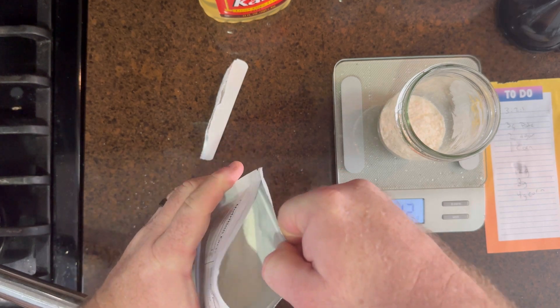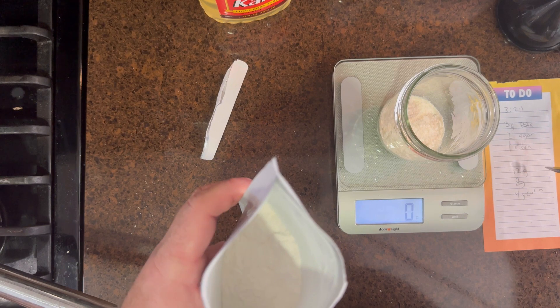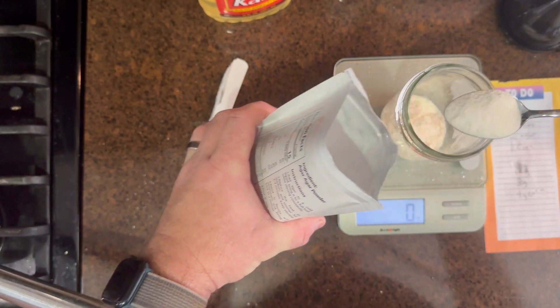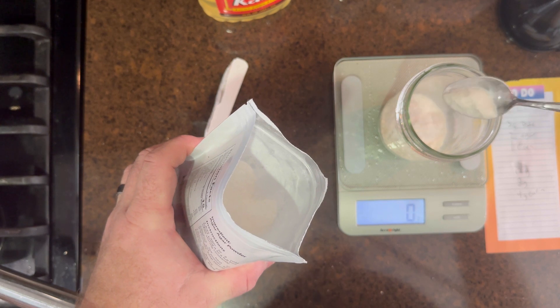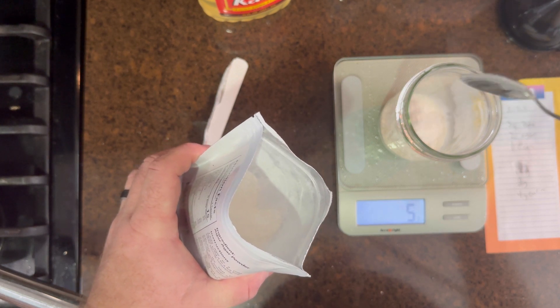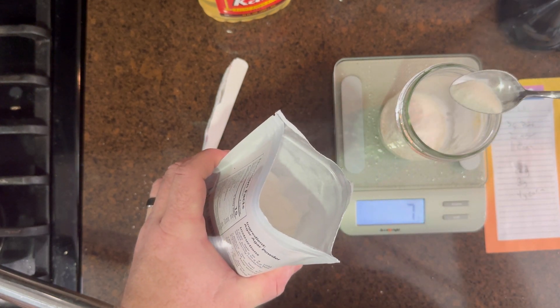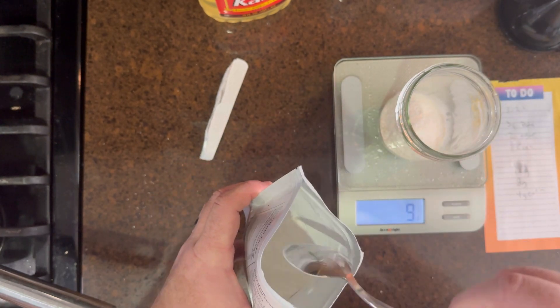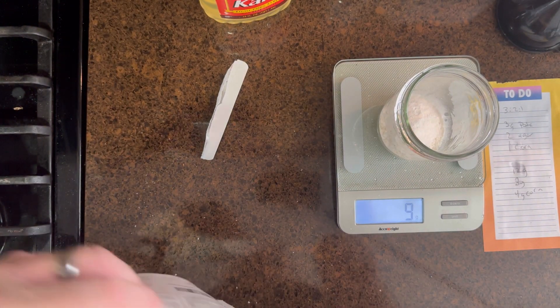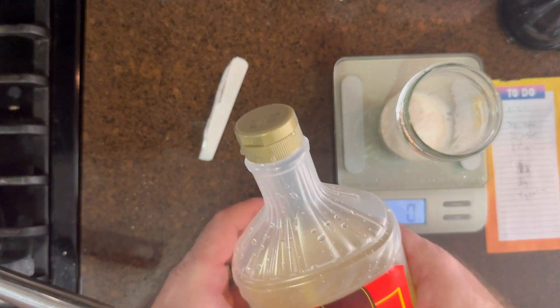Eight grams of agar agar here. I bought this off Amazon. I know that Philly Golden Teacher uses the Telephone brand — I probably should have, but this is what I bought before I found his video. It's good enough; it's cheap, so I would suggest you stick with something cheap. You don't need anything really expensive for the agar.